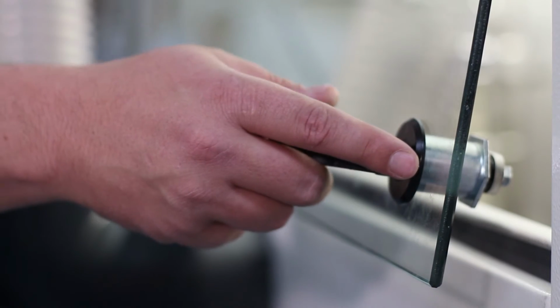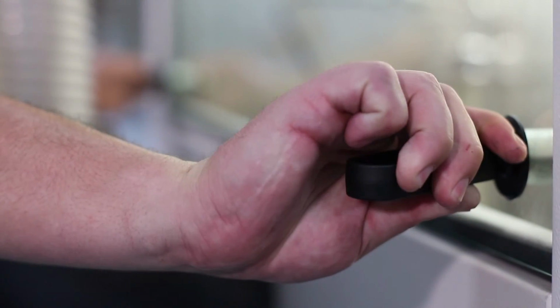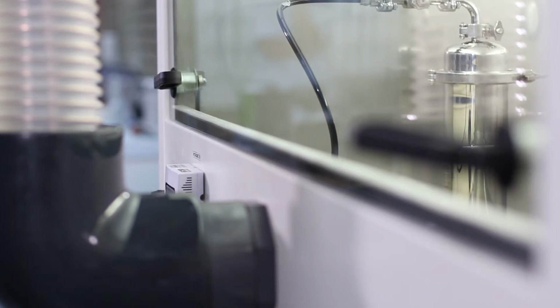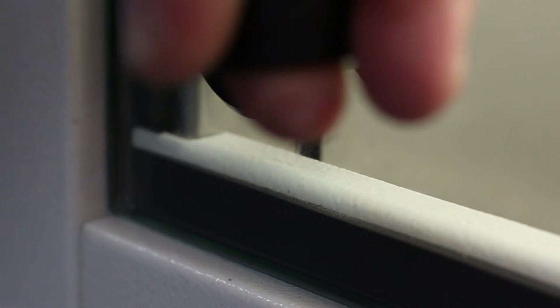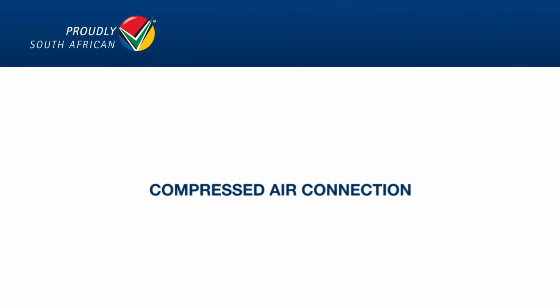Airtight seal. During the disinfection process, the cabinet must be made airtight. The front window should be hermetically sealed. Devices may have to be provided by the biological safety cabinet manufacturer to compress against the glass to produce the best possible hermetic seal. If a hermetic seal is not possible, it will be necessary to cover the whole hood with a plastic bag to isolate the cabinet from the environment.